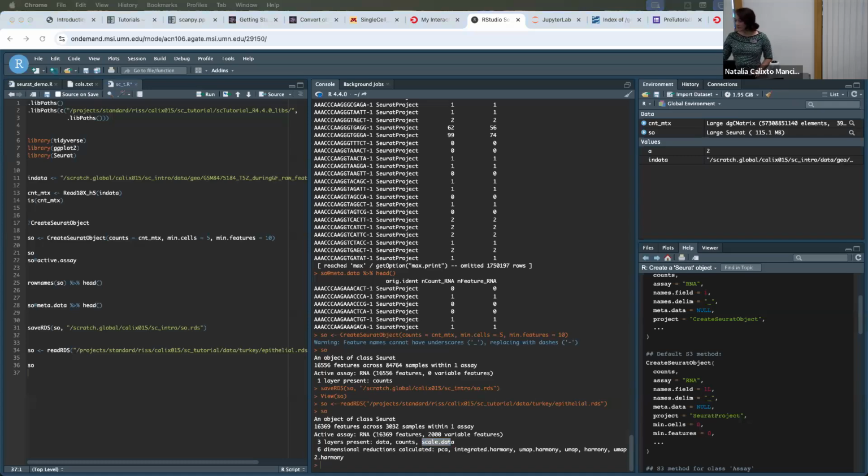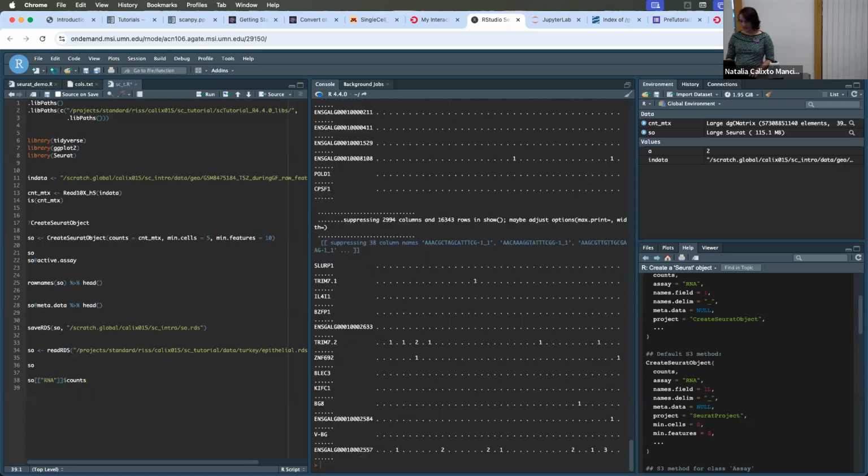So let's see how the gene expression is modified with the analysis. If you look at the RNA assay and then the counts, you see the matrix that we're familiar with, but lots of dots and then integers, like this is 1 count, 2 counts, that's it.